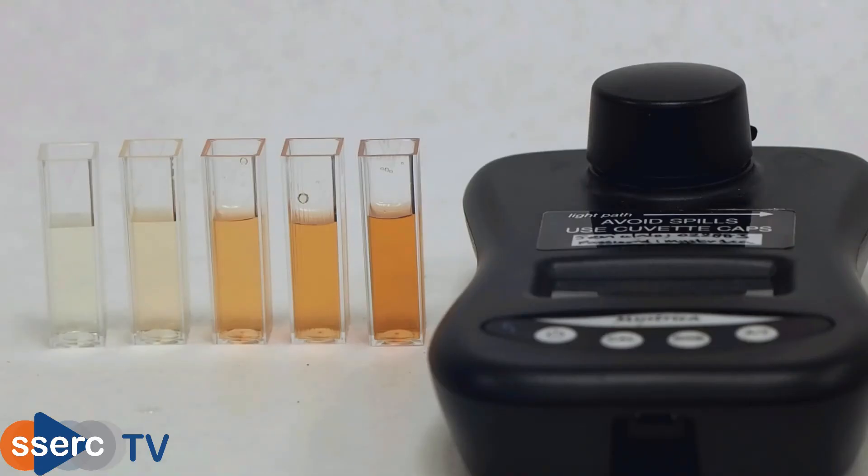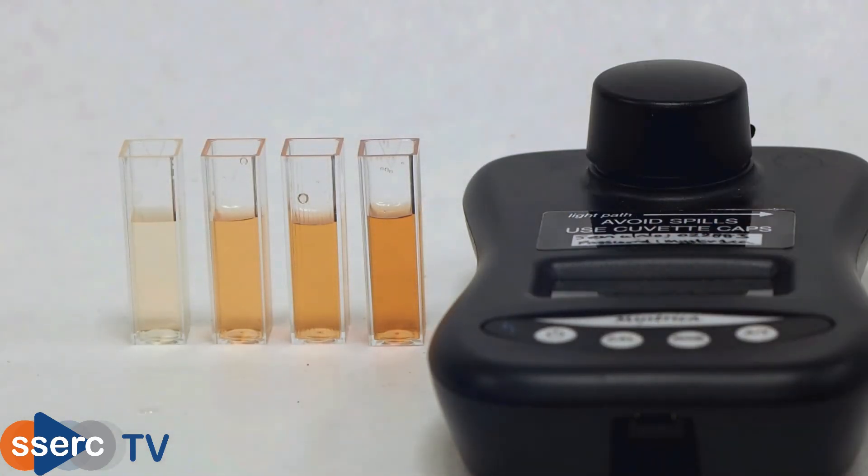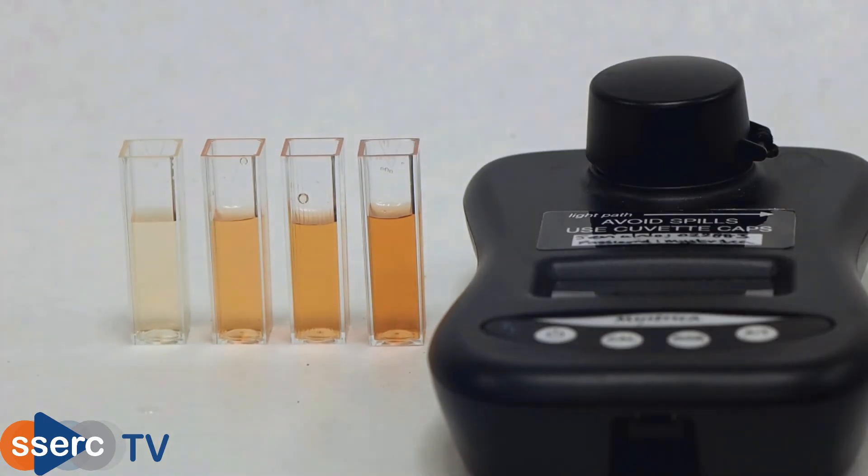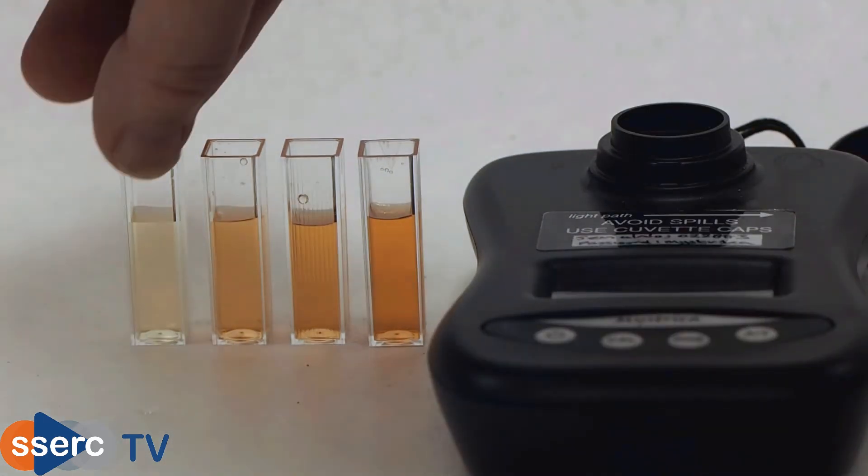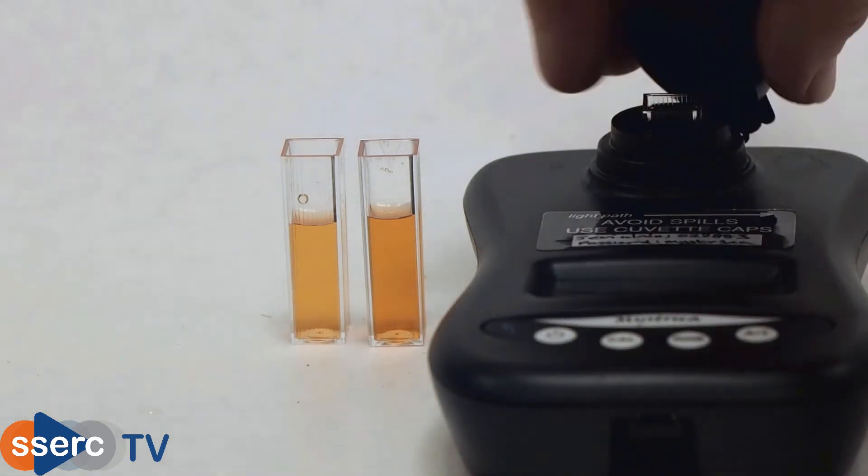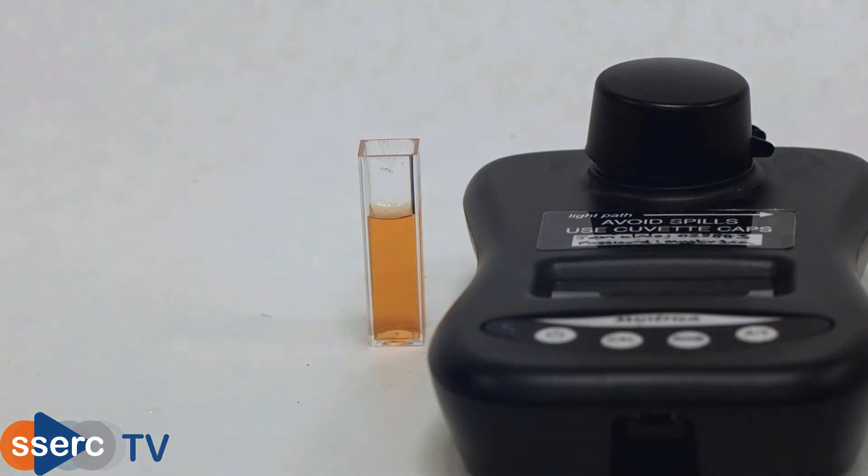Now we transfer three cubic centimeters or so of each solution to a cuvette and determine the absorbance of each. Remember to zero the colorimeter with the cuvette of water first and to use the right wavelength. For the Mystrica colorimeter we're using here, use a blue LED. If you're using a different one, you want a blue or cyan color with a wavelength of around 490 nanometers.